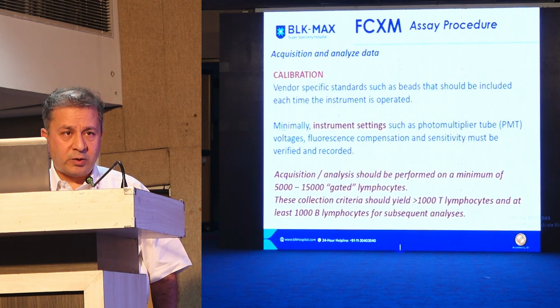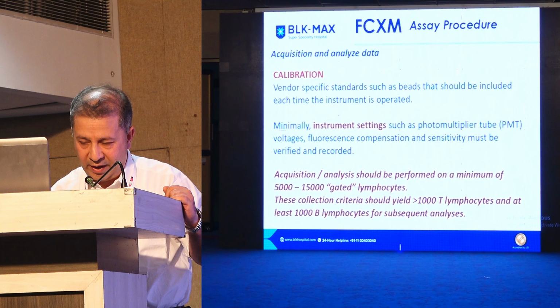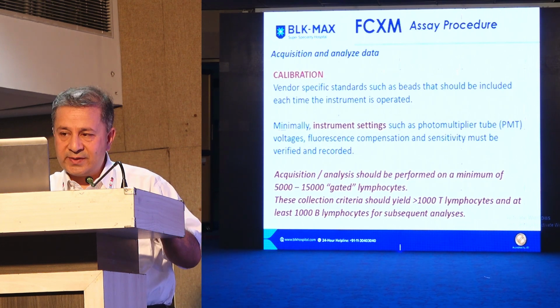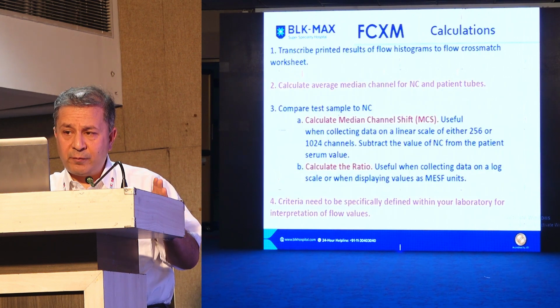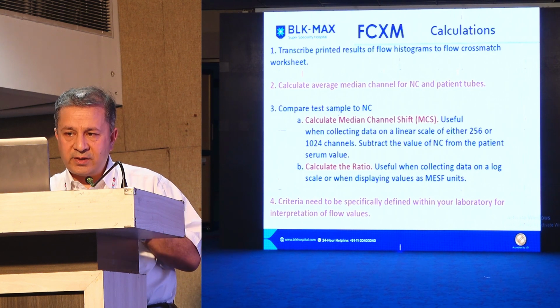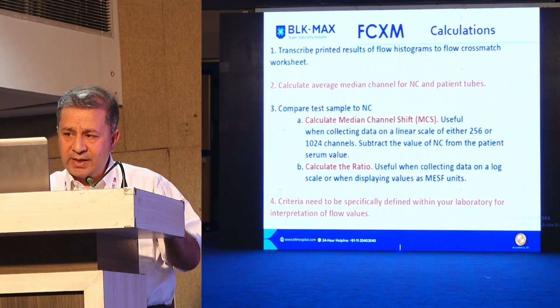Of course, we also need to remember one very clear thing, that we need to have a very well calibrated instrument, and the protocol should be set up nicely. There is a concept of median channel shift which you should keep in mind. That's a shift from a negative versus a positive, and I'll show you that in my subsequent slides.